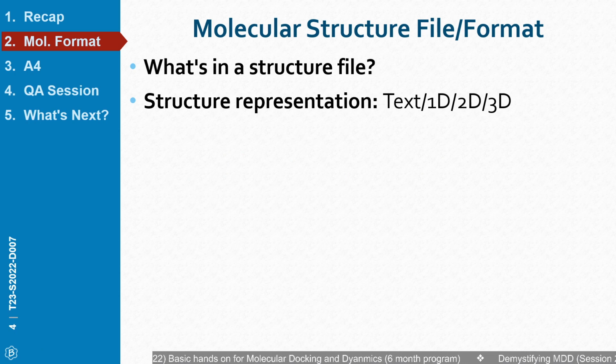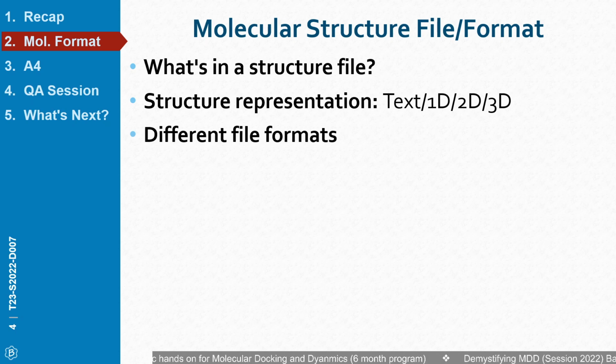So like this, there are different structure representations, and those structure representations have different formats. Before going to different file formats, I want to tell you the meaning of a format.